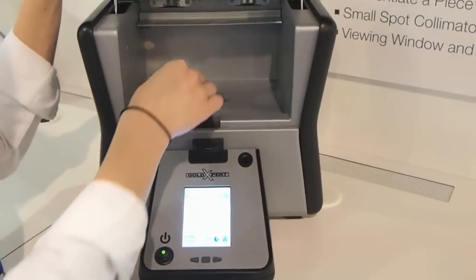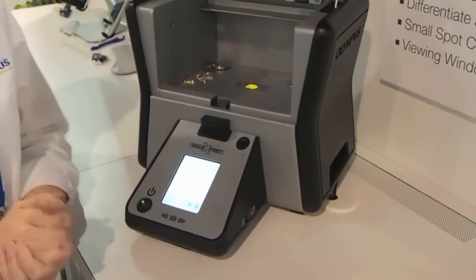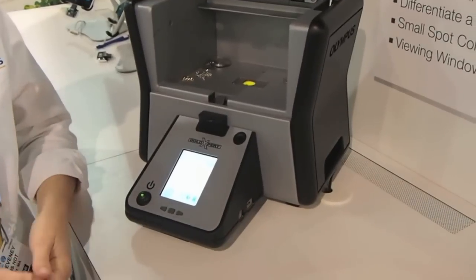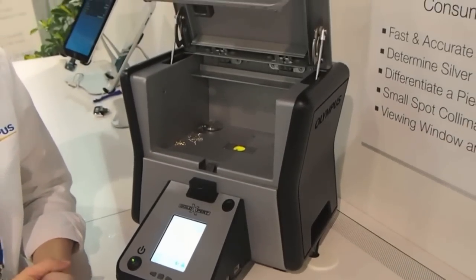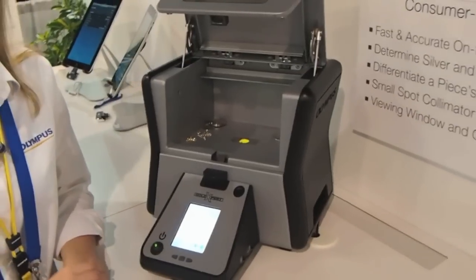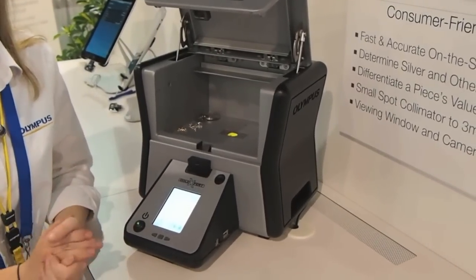We also have a plating alert feature for gold alloys, which will alert the user when it is not a solid gold sample — when it is just a gold plated sample. We have a carat calculation on this instrument, which will convert the percentage of gold to the appropriate carat weight.